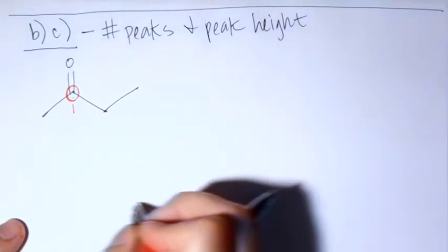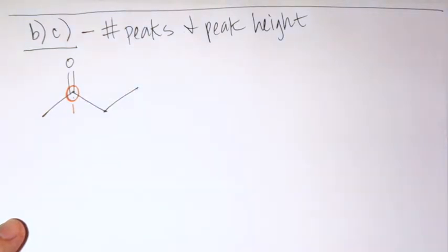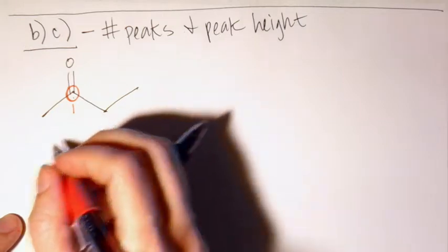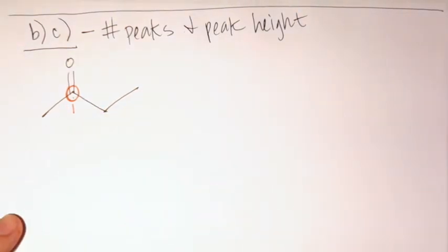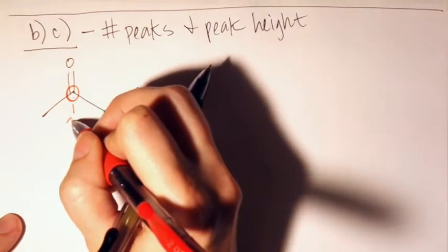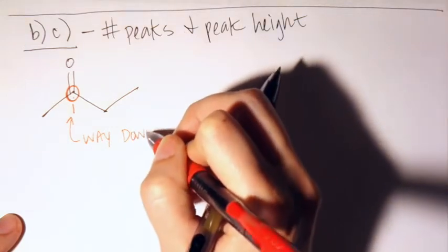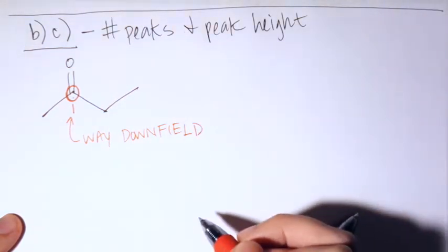If you read through your handout, you'll see more information about how to number your structure. Normally it's based on your spectrum. You number all the peaks, and then you match those numbers to your structure once you have the structure assigned. Here we're going backwards because we're starting with the structure and coming up with the spectra. The most downfield peak is going to be carbon 1, because that's a carbonyl carbon.